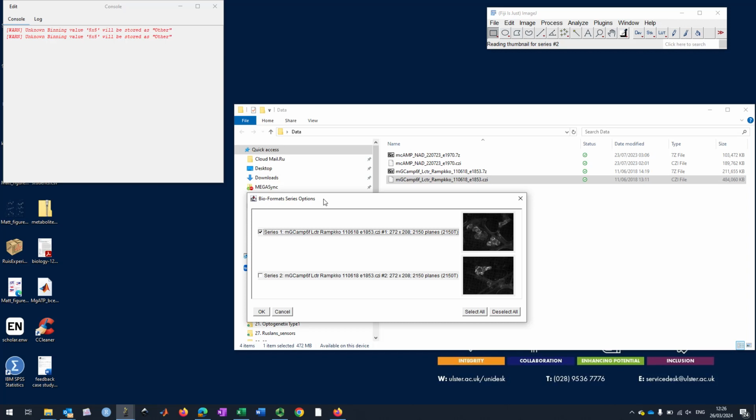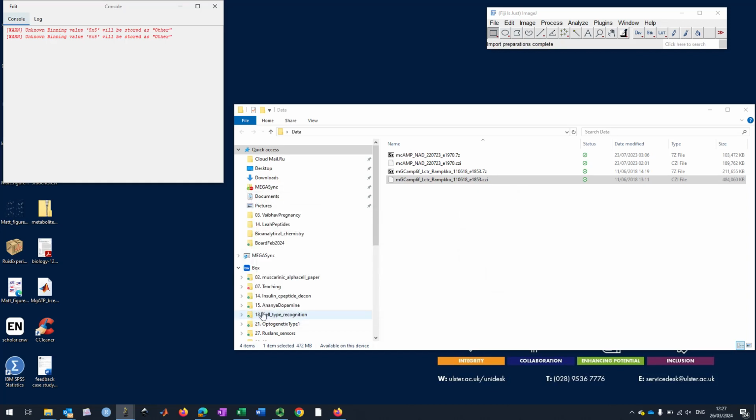Solutions were perfused. The reason for imaging two is, first of all, your throughput is higher, and you can compare objects that have different conditions in them. So we would like to ideally analyze all the objects, all the series. They are quite big, I must say.